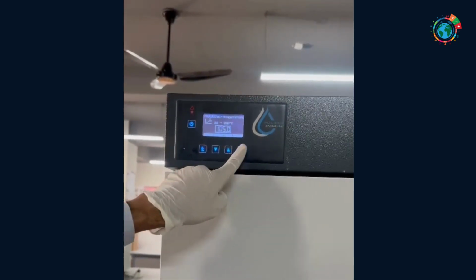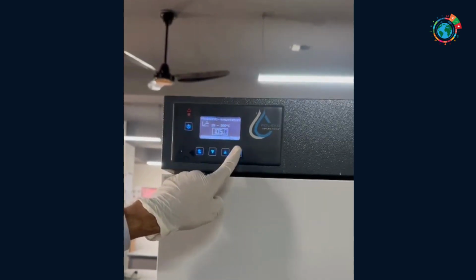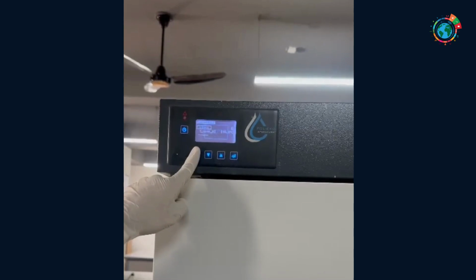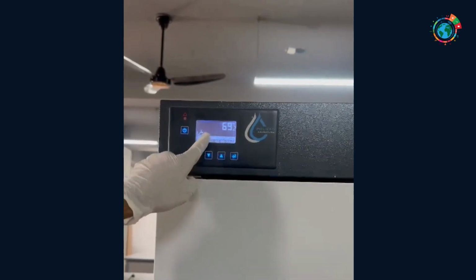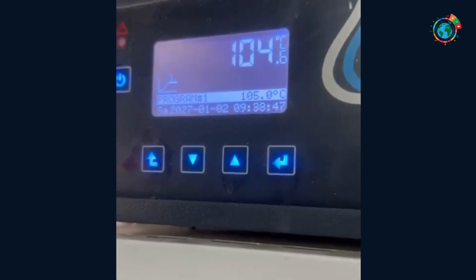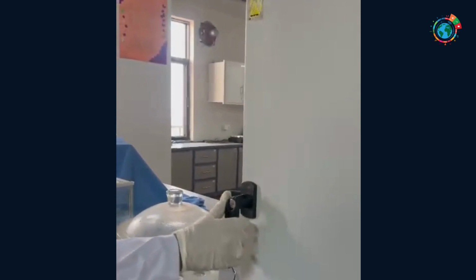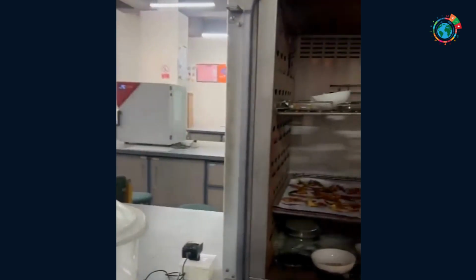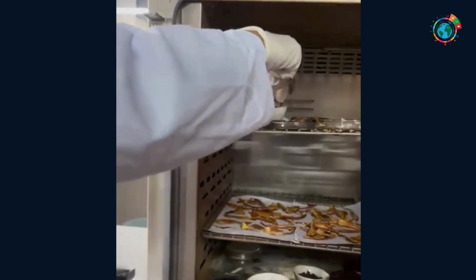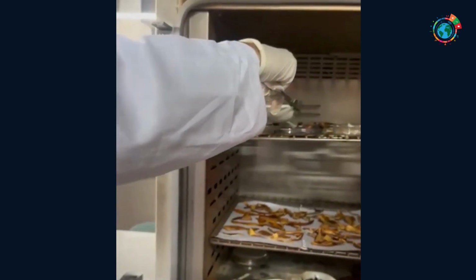Once the desired temperature is set, the oven's heating elements or system adjust accordingly to reach and maintain the selected temperature within the oven chamber. After 30 to 45 minutes of drying at a temperature range between 100 to 110 degrees Celsius, the china dish is removed from the hot air oven using metal tongs. This preheated china dish is immediately shifted to the desiccator for at least 30 minutes.